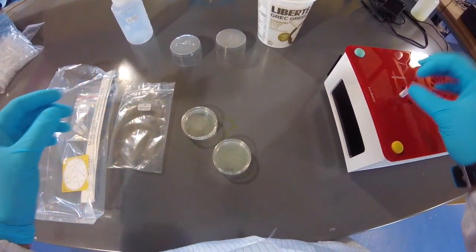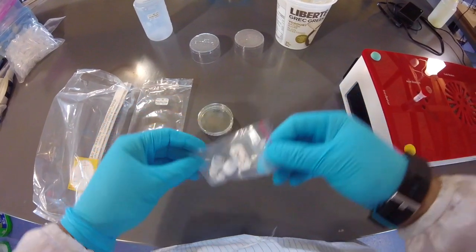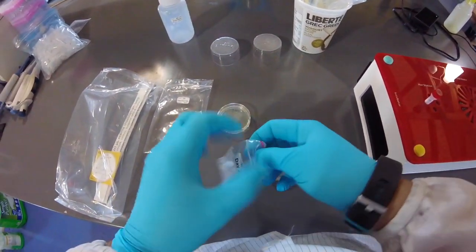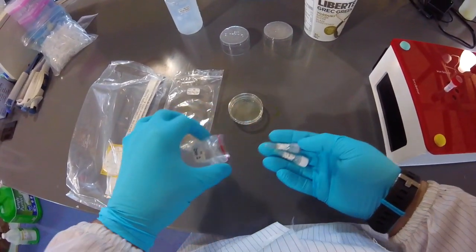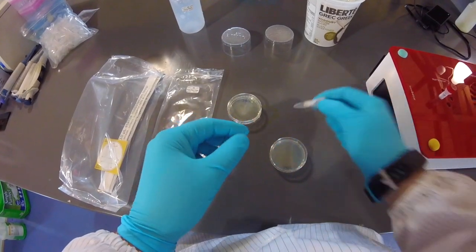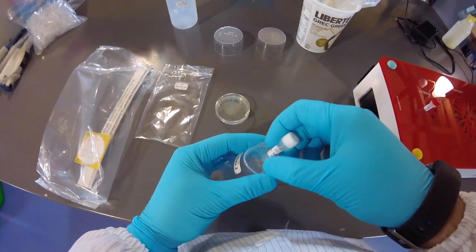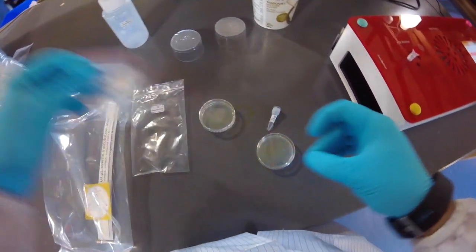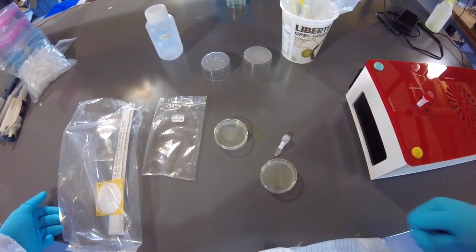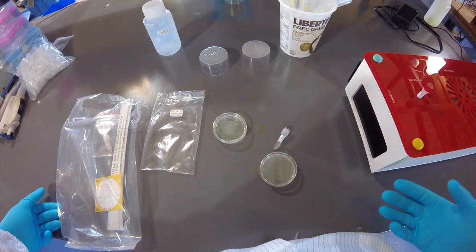And then the other thing we're going to do is also streak or plate out some positive cells onto the plus plate. And the positive cells are already engineered cells, all right? So they already have the antibiotic resistance. They already have a plasmid that can create a particular color pigment. And the positive control is similar to the negative control, except it's sort of the opposite, in that in this case we would expect a positive result, which would be the growth of the cells, right?